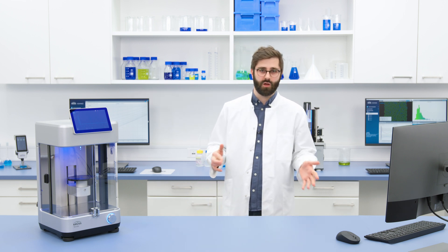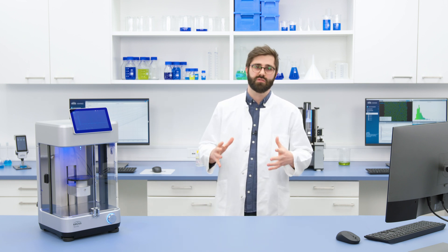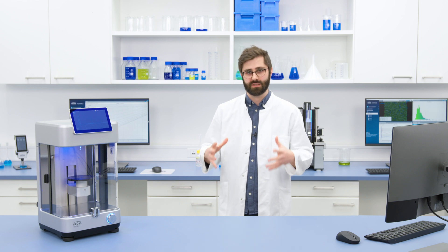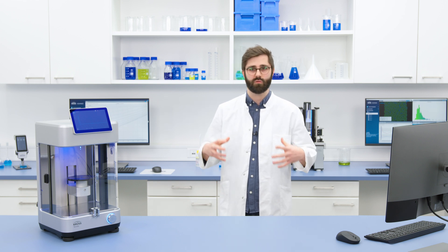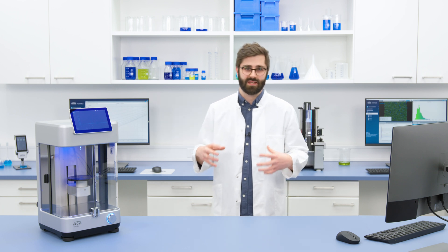Now while early tensiometers were designed specifically for that purpose, the integration of new digital technology has transformed these devices into incredibly versatile lab instruments, and it's this flexibility why you can find tensiometers in research labs throughout an impressively broad range of industries.